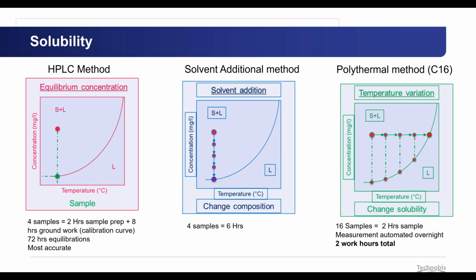You do not have that much flexibility there. You need to prepare your samples. You need to leave them to equilibrate for at least 24 hours, or even worse, 48 hours, depending on the procedures in each company. After that, separate liquids from solids, make dilutions, and then start to measure. It takes quite some time, a few days, until you finally have some data.